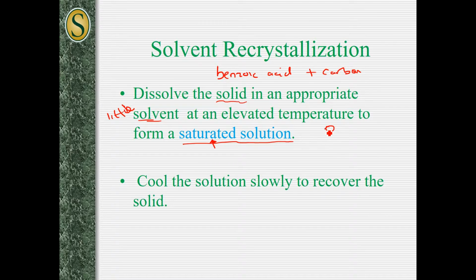You'll take your sample and drop it into an Erlenmeyer flask, and this experiment is going to be demonstrated by me because of time, in the mixed class. So we'll take a sample and drop it into an Erlenmeyer flask. That's the benzoic acid with the carbon in the flask, and then we'll be adding a portion of 10 mL of water, followed by, I think, 1.5 mL or 2 mL portions into the flask. We'll add while heating on a hot plate.